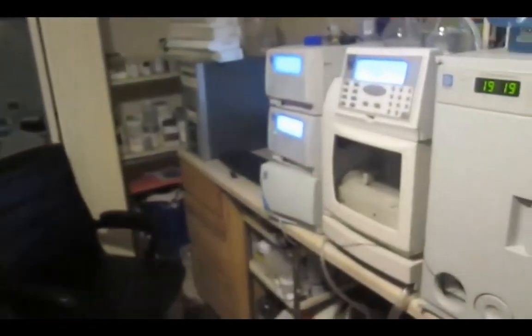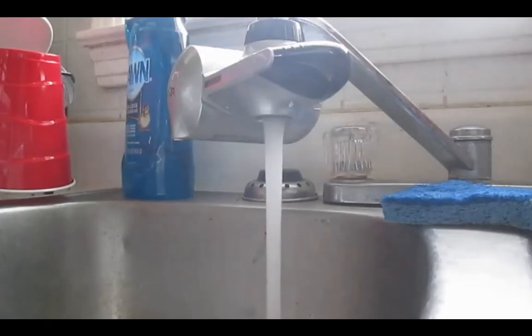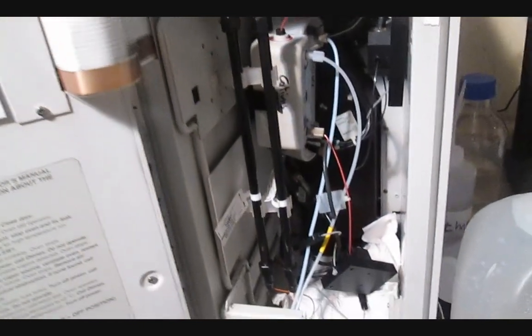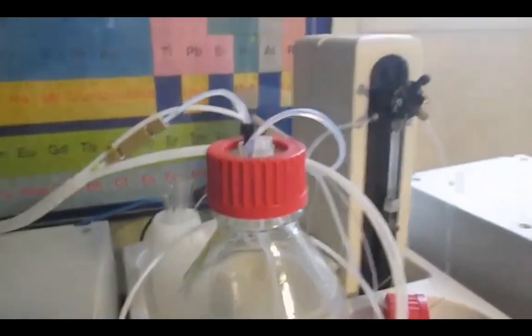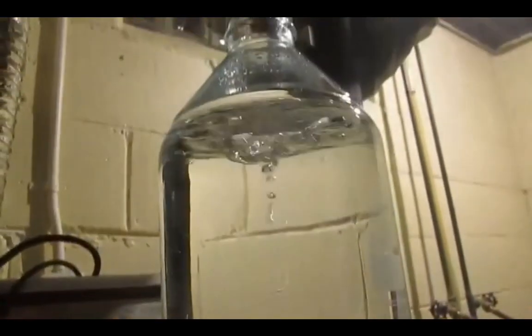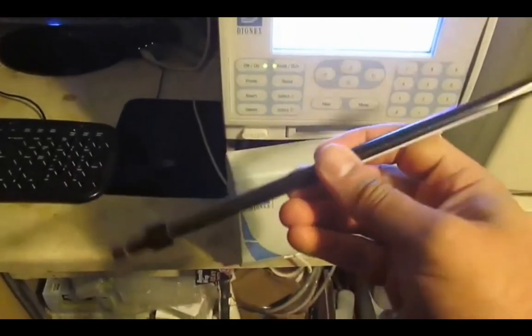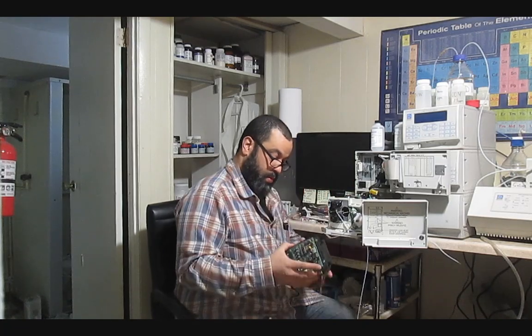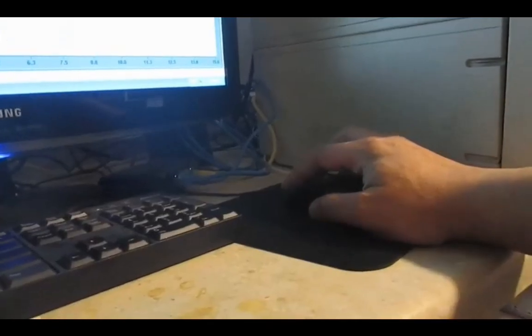Hello and welcome. A few months ago I set up an ion chromatograph and proceeded with a few analyses mainly about water quality for anions and cations. Switching between the two analyses requires a new column and suppressor, but the mobile phase is different, so a thorough flush is needed followed by an equilibration time — which could take a while — before yet another calibration. I've grown tired of this predicament, so with a few additional parts found on eBay I set up a second channel. I can now switch between the two analyses simply by clicking on it.